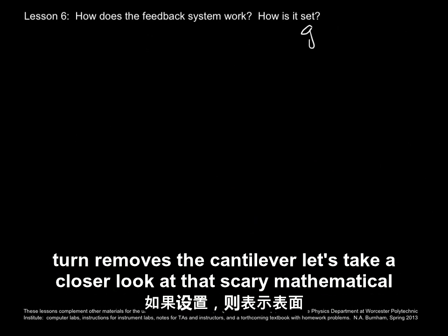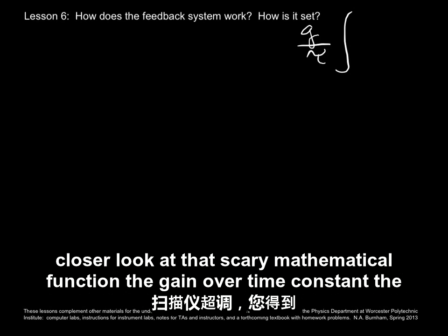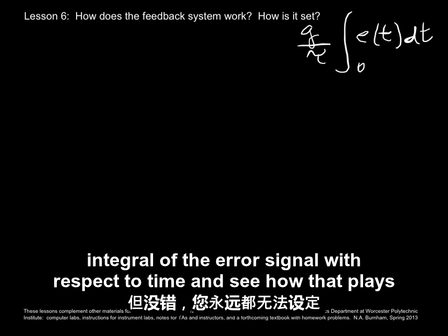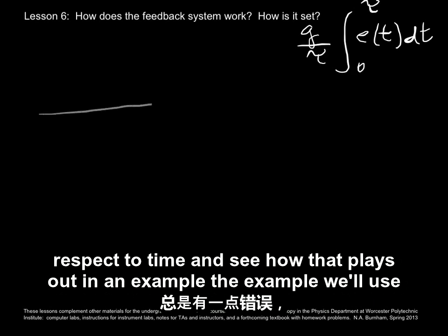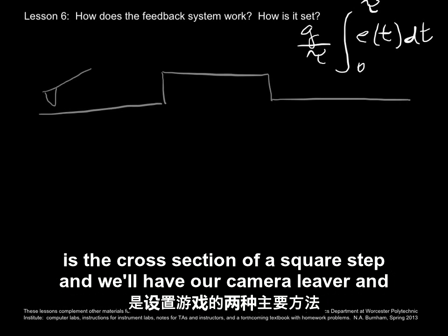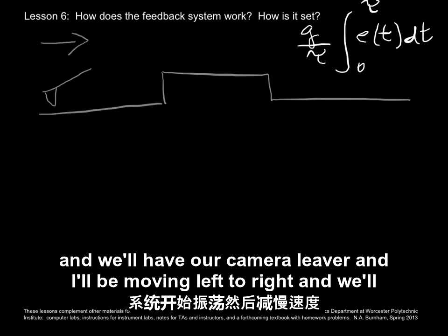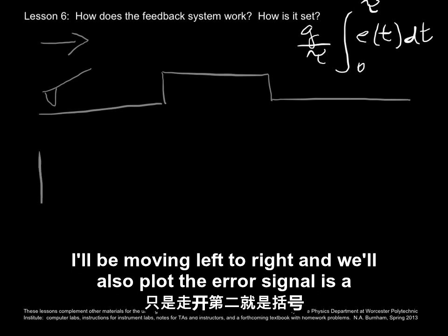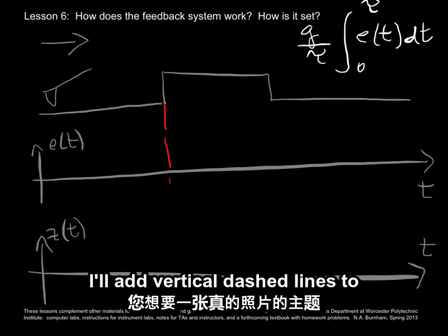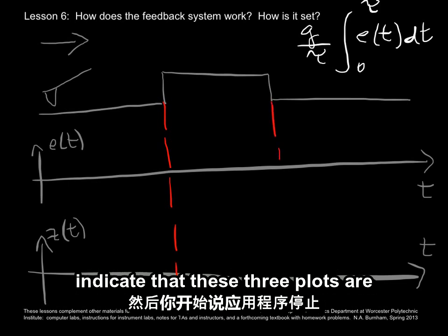Let's take a closer look at that scary mathematical function. The gain over time constant, the integral of the error signal with respect to time. Let's see how that plays out in an example. The example we'll use is the cross-section of a square step. And we'll have our cantilever, and it'll be moving left to right. And we'll also plot the error signal as a function of time and the Z signal as a function of time. I'll add vertical dashed lines to indicate that these three plots are aligned.